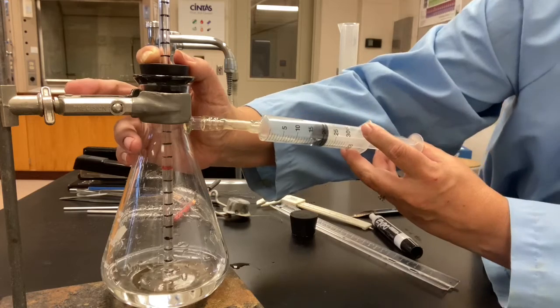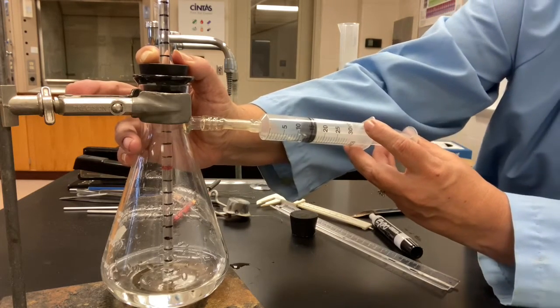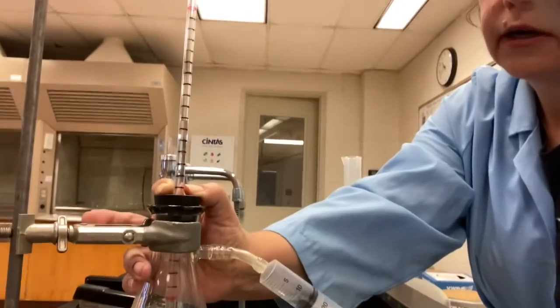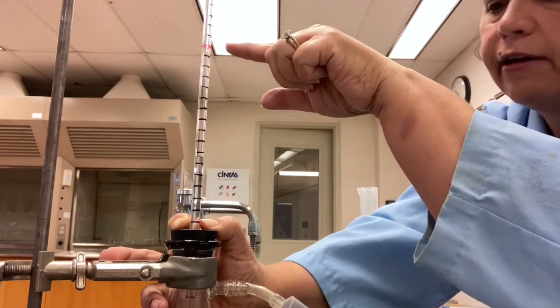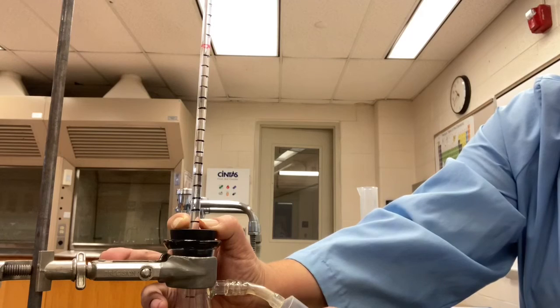So now I'm going to adjust the syringe to 15. And there's my water level above the cork again. So now I can read it. Now I have to read backwards. There's a red line up here, right there. That's 25 away from a red line that's below here. That's going to help me count. So that was 10 there.